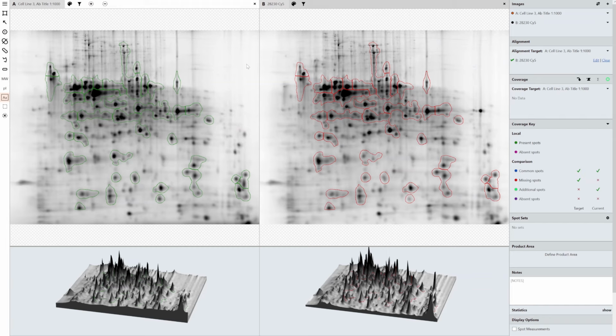Again, it's all about building up the history of the project with a view to, if someone opened this project in 5 years, would they be able to understand it? And how can I include information that's going to help them understand it if I'm not available, if they can't just come and speak to me, or if I can't remember.